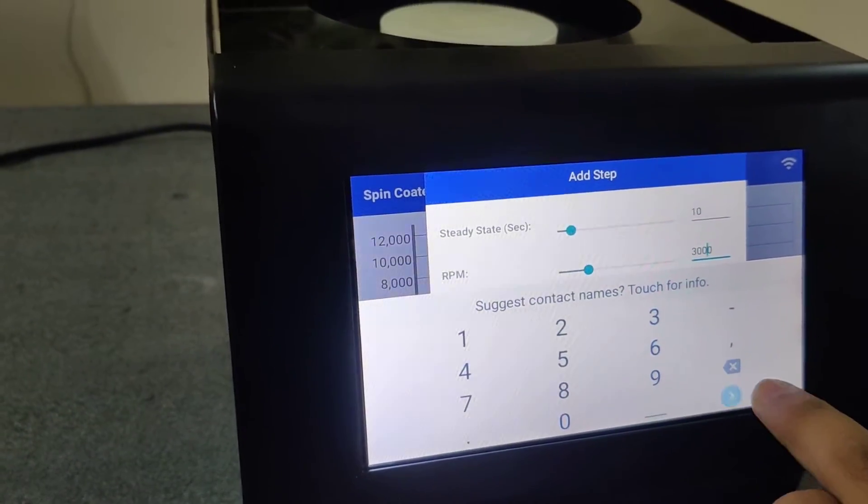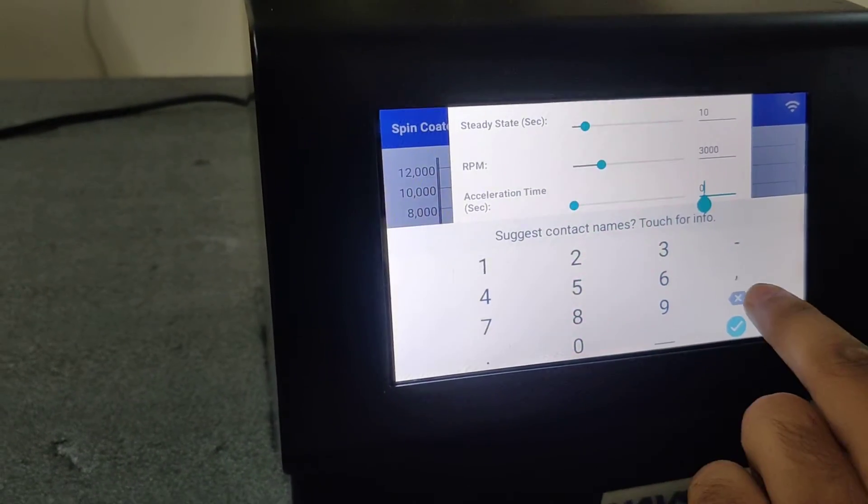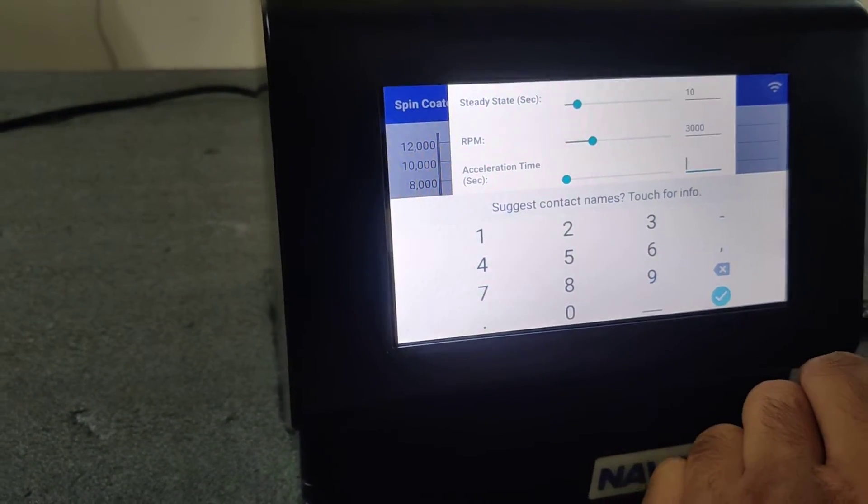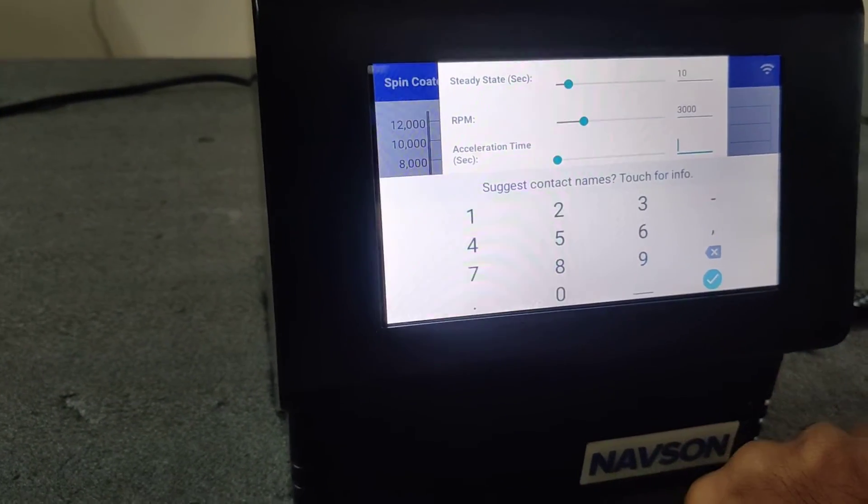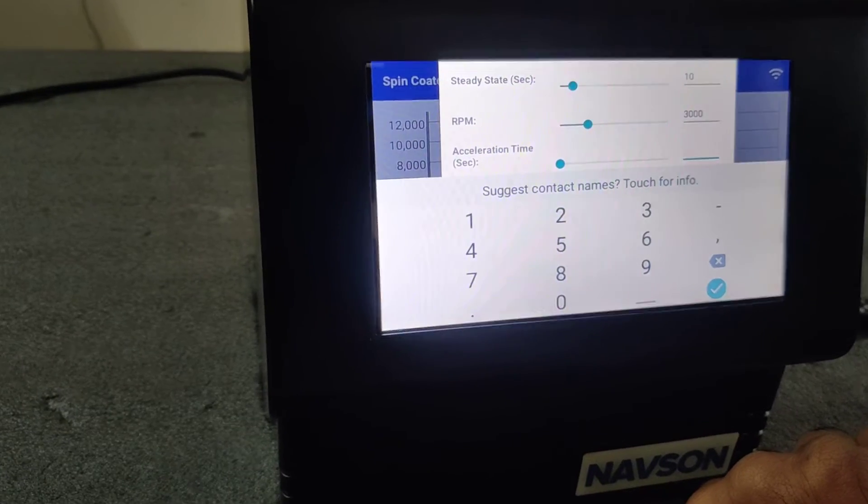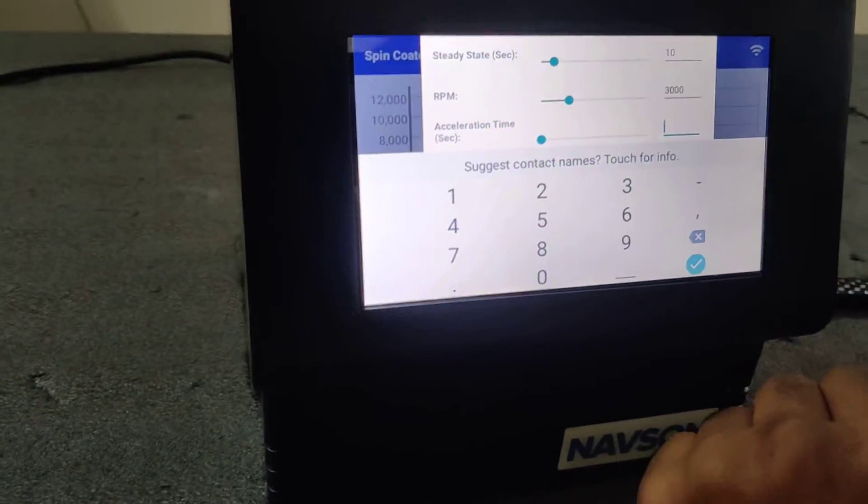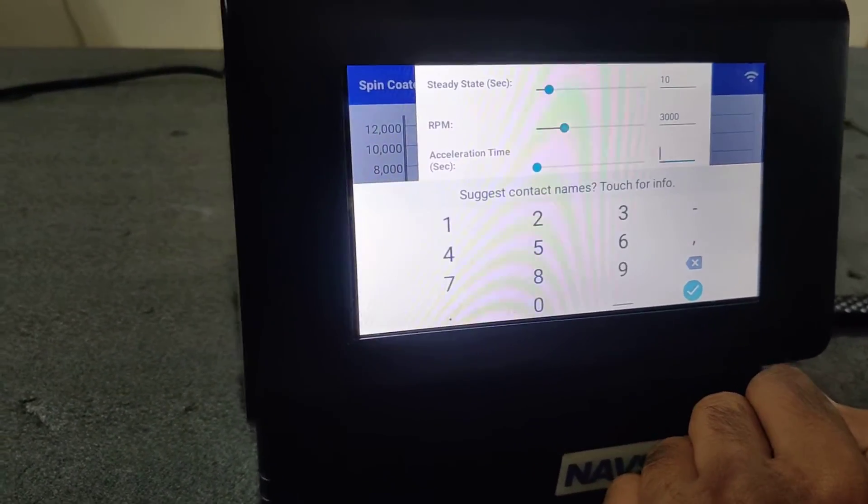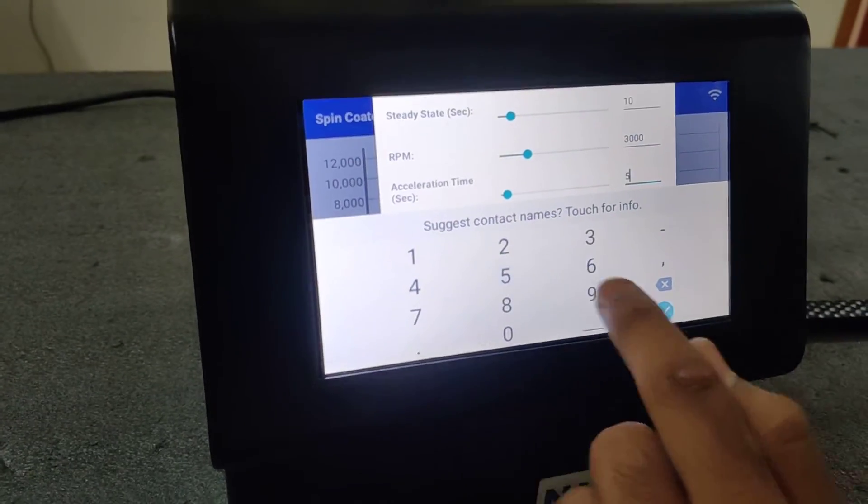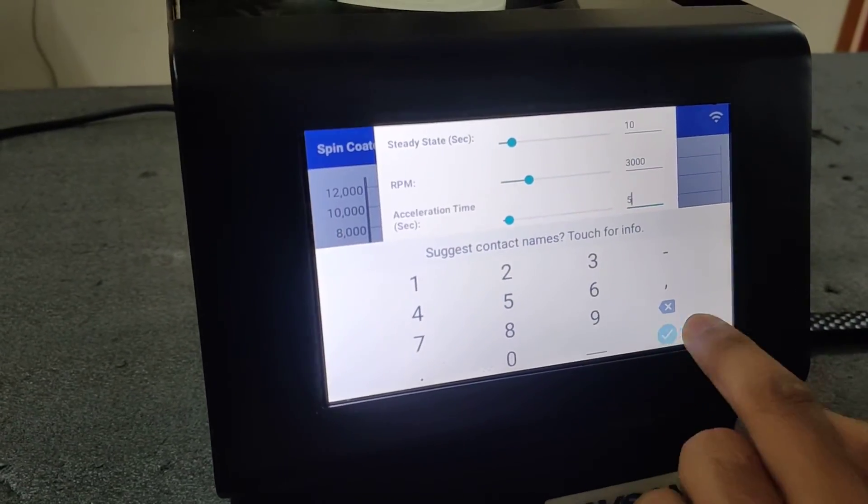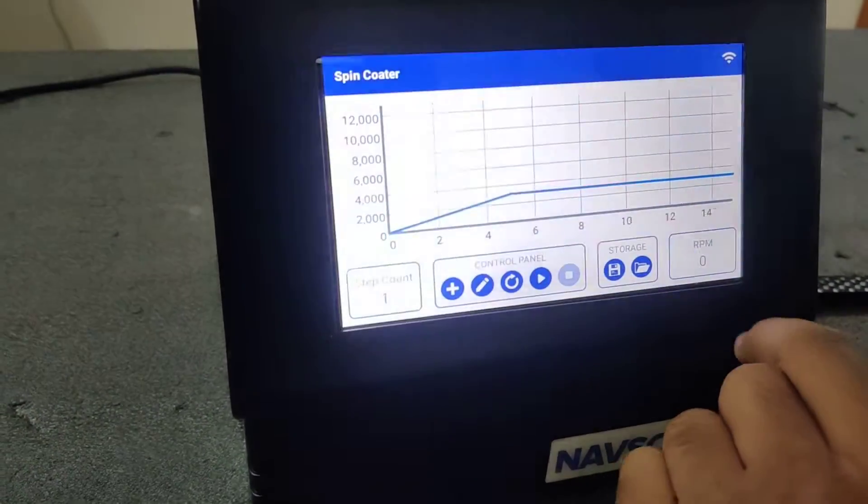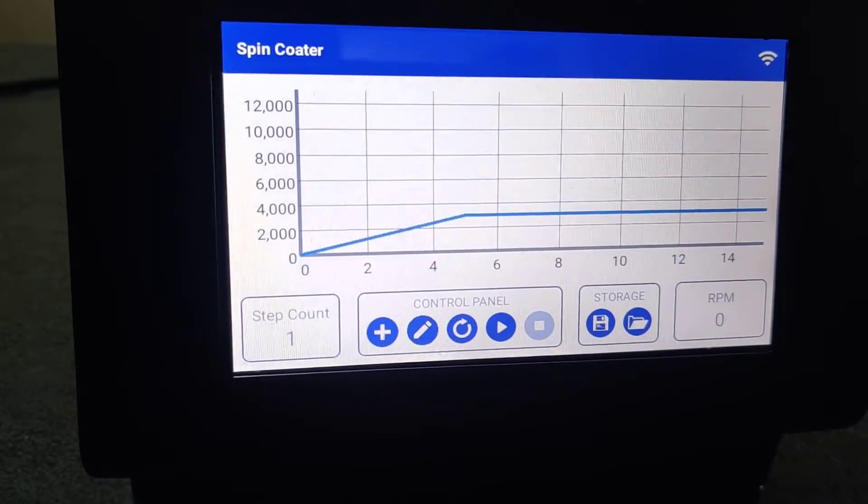Acceleration is how many seconds you need to reach 3000. Either zero means it's instant, or 2, 5, 10, or 20 like that. So we will put 5 seconds as acceleration. Okay, so this is the graph you will be getting.